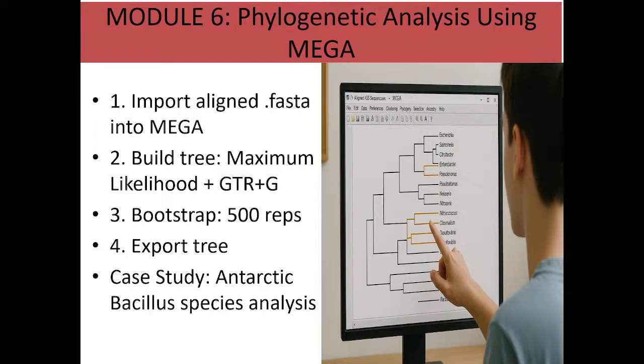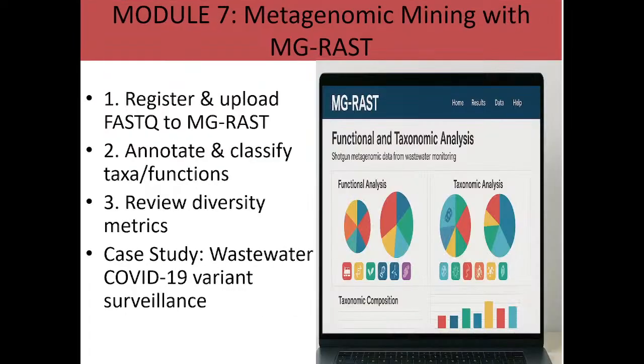And that's the reason why it is always good for you to know how to use more than one tool for any purpose. If you don't know how to use more than one tool, you will not be able to subject your result to a validity test. So that is exactly what we have to do.